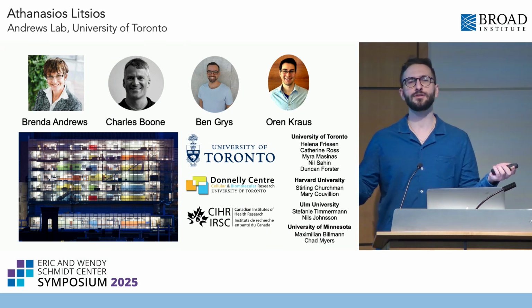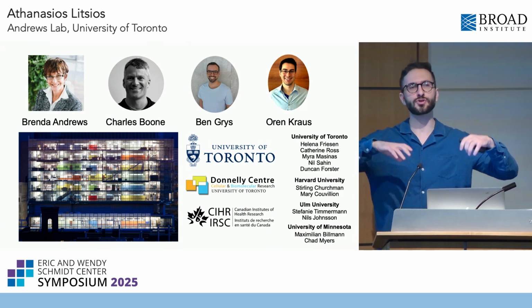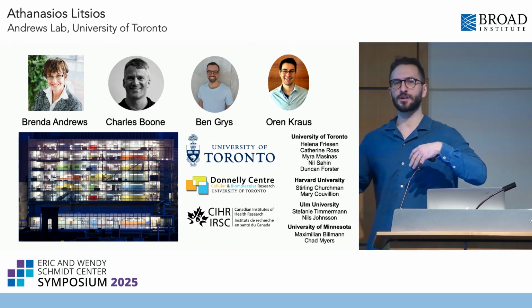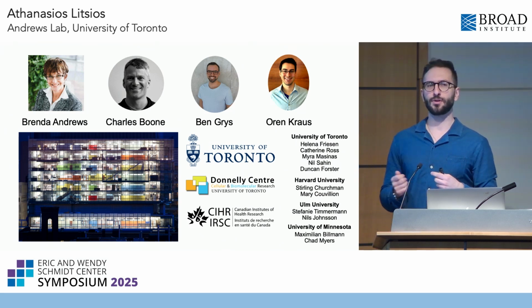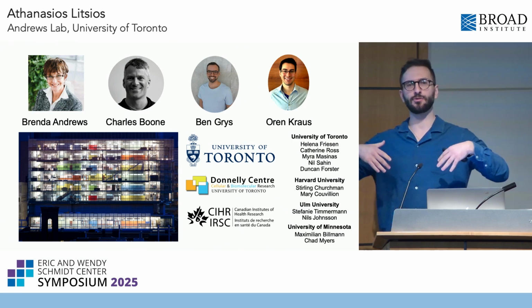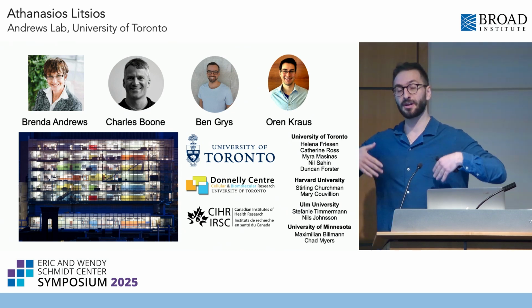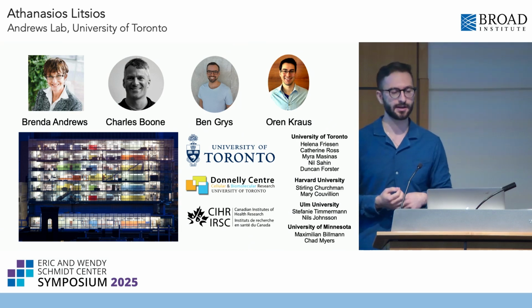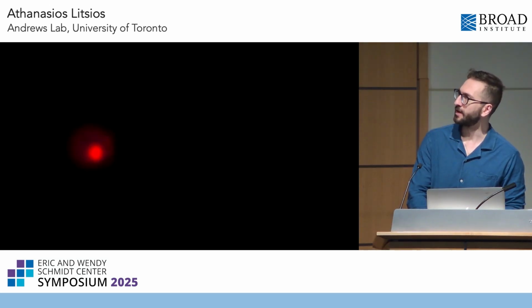So how can we potentially use snapshot images of live cells to reconstruct the dynamics of subcellular structures as a function of the cell division cycle? I mentioned at the beginning of the talk that we're interested in understanding how intracellular organization emerges during the cell cycle, so how intracellular organization changes as a function of the cell cycle. And to map that, ideally, we would like to have some videos like that.